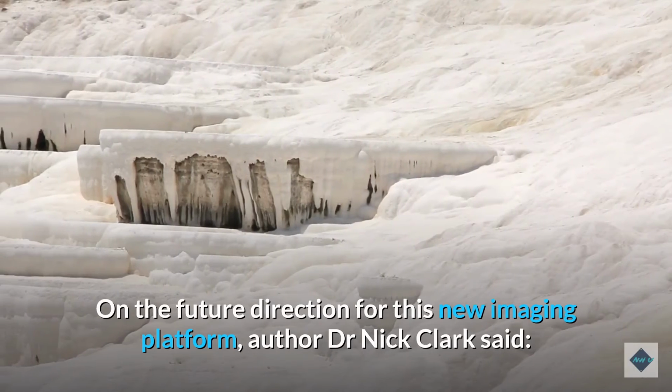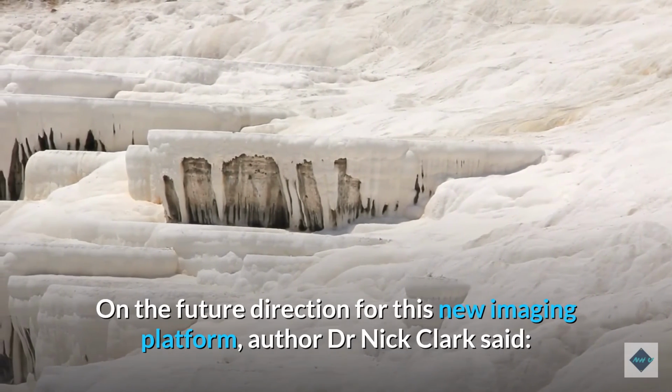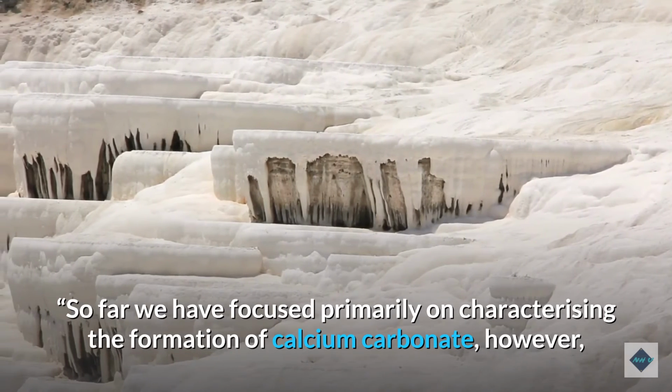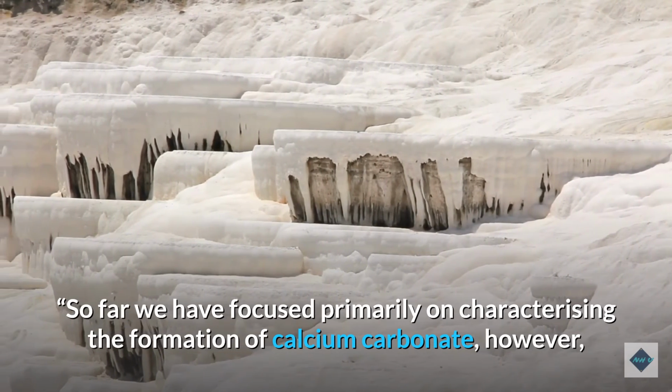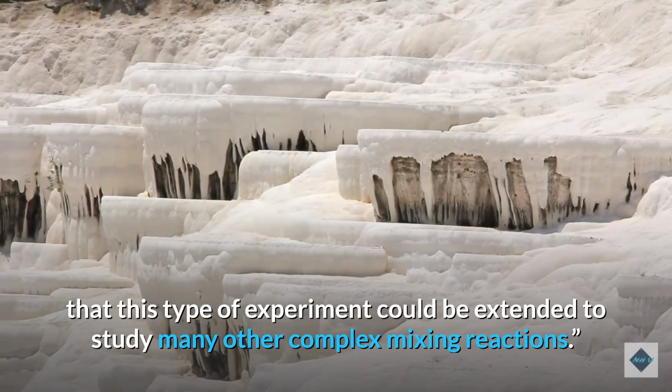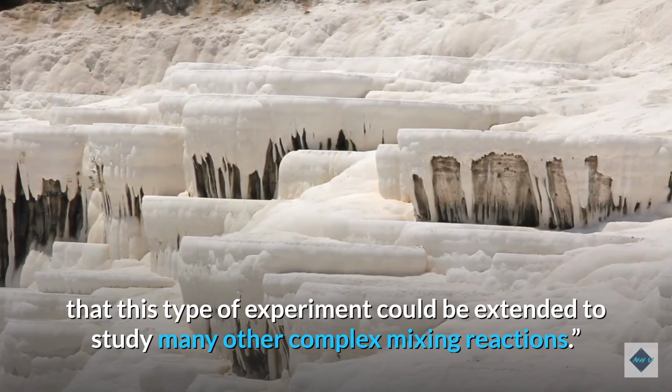On the future direction for this new imaging platform, author Dr. Nick Clark said, "So far we have focused primarily on characterizing the formation of calcium carbonate. However, we are optimistic that this type of experiment could be extended to study many other complex mixing reactions."